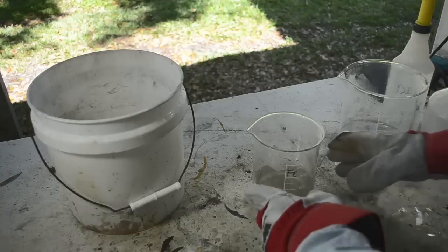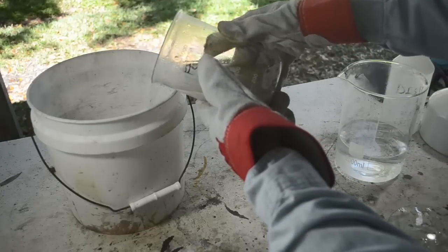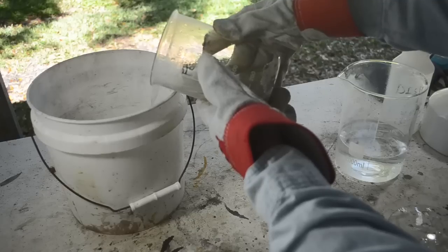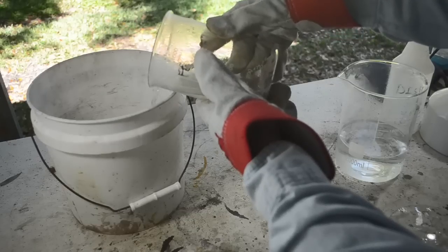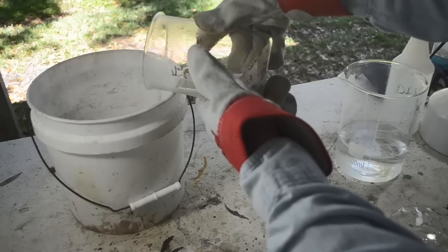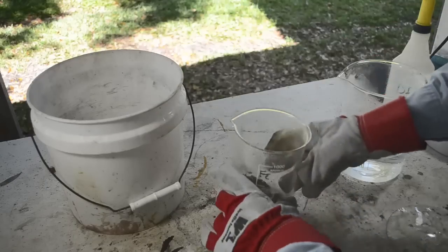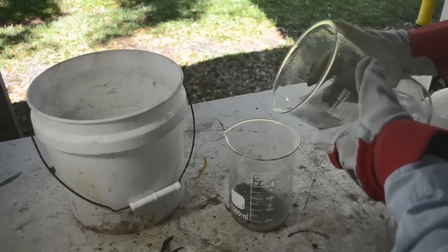Okay, I think this silver's about as clean as I can get it using this method. I haven't seen any trace of color for the last few rinses. I'm going to give it one more after this. I must say it does look like pretty clean silver at this point.